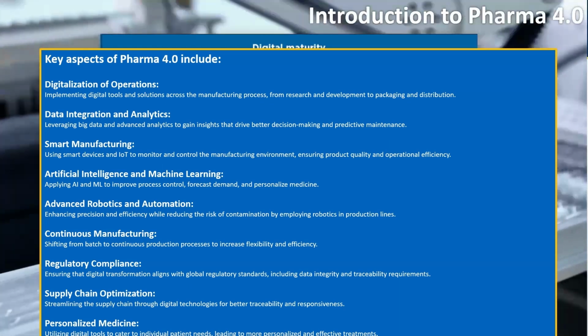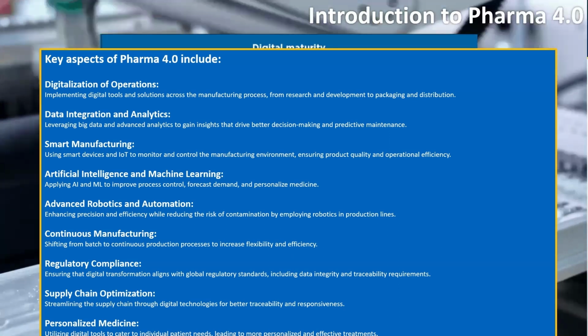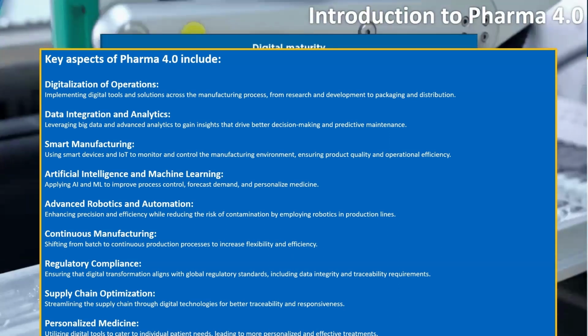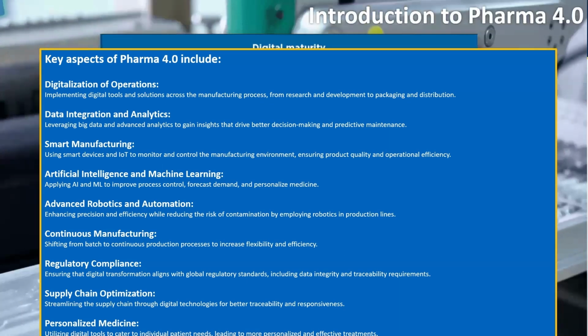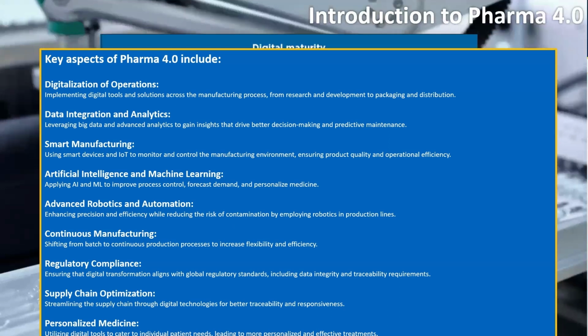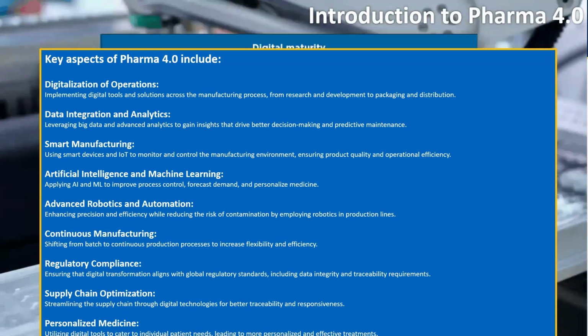Was there an operator present? Did the operator intervene into the process? Are they aseptically gowned up? Is there face covering, their sleeves, preventing exposure of skin? Have the gloves got any holes or slashes in the gloves where particles can be generated directly from the operator? And these are biological particles.